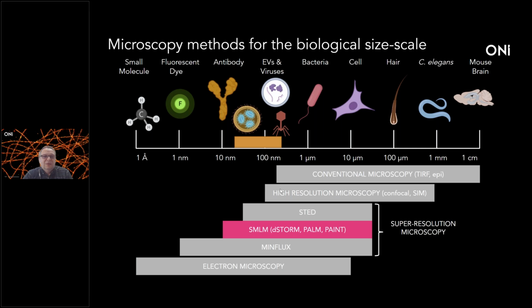So what is the diffraction limit? The diffraction limit is a size where you can still resolve two objects as separate from each other. If you use conventional microscopy, it is roughly half of the wavelength you are using, so it is approximately 200 nanometers. And as I mentioned, these particles are below 200 nanometers and usually are around 60 to 100. So what other technologies could we use to study these particles?